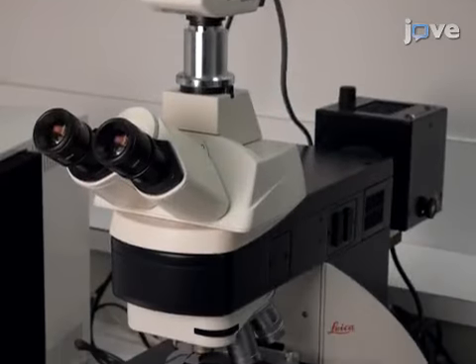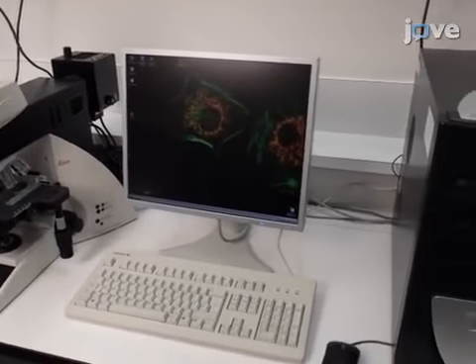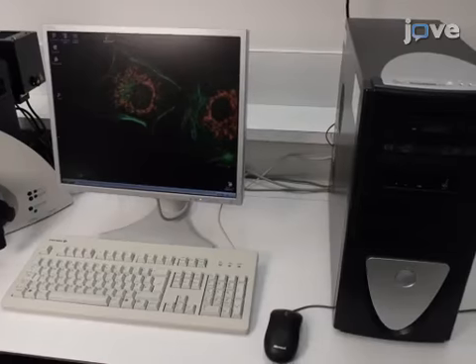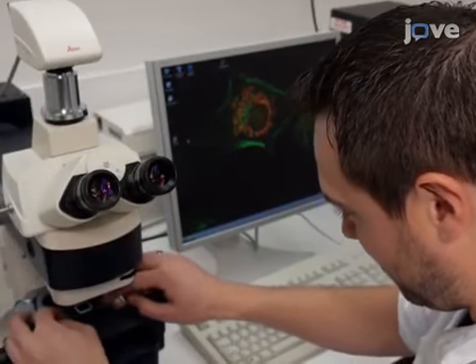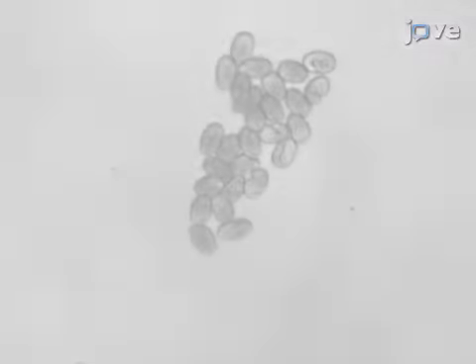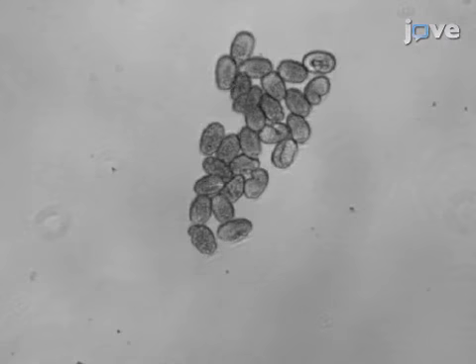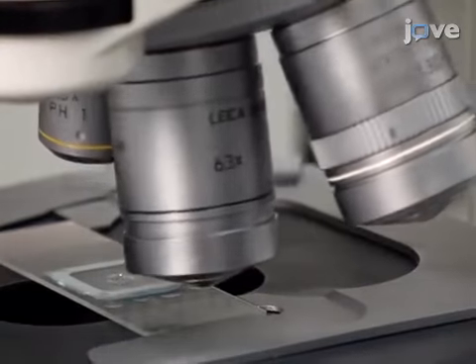This procedure requires DIC lenses, prism, and a video capture system for time-lapse microscopy of Z-stacks. First, position the slide-mounted sample for viewing. Preparation details are in the text protocol. Beginning at low magnification, identify embryos in their pre-morphogenesis stages. Then, add a drop of oil and use a more powerful objective.